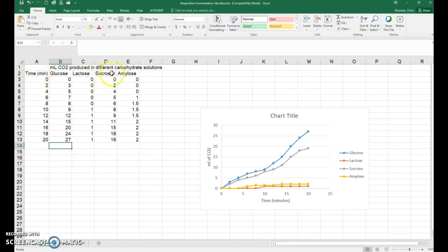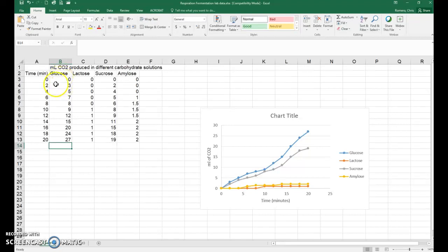As you can see, I've got my data all set up, and I've clicked on a cell underneath the data for CO2 production for the glucose carbohydrate that was added to the yeast. So I'm going to calculate that rate. You can follow this exact same procedure for all of the other carbohydrates.